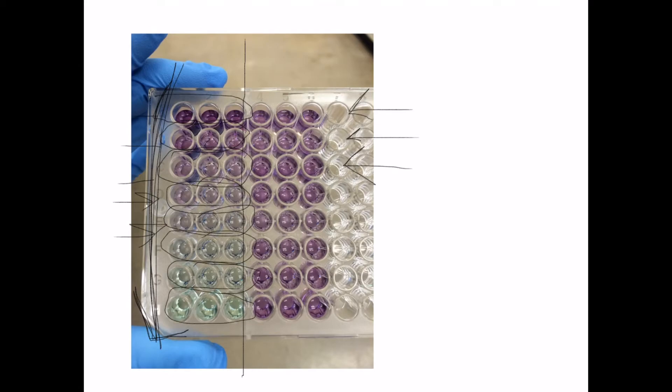And then once this is put in the plate reader after it has been made, it will measure the absorbance, and that can be used to calculate how concentrated the protein is.